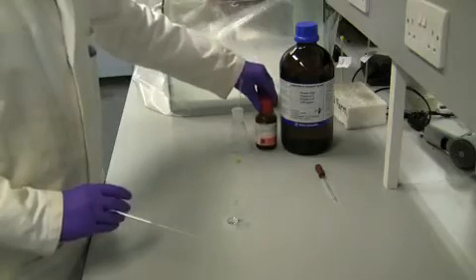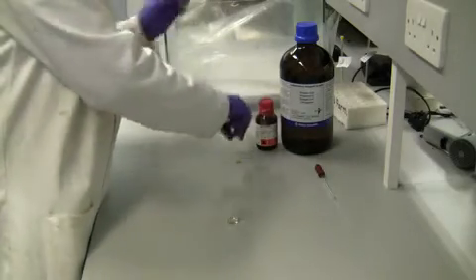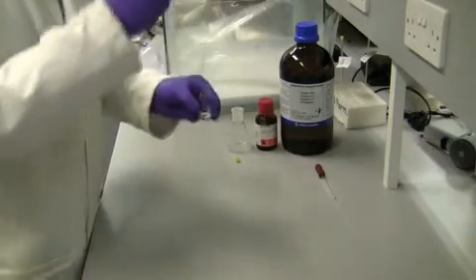The prepared sample is then transferred to an NMR sample tube, which is sealed and labelled.